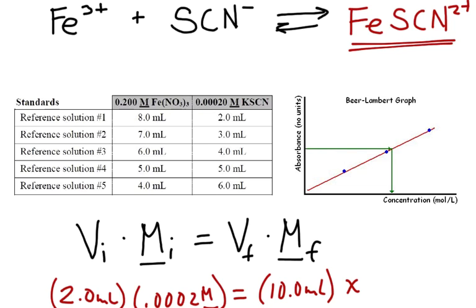Well, we start off here with the idea that one group of people were working on mixing together standard solution. To make a standard solution of this was a little bit tricky in that we had some iron nitrate solution, and even though it's iron nitrate, the nitrate for us is a spectator ion. We don't concern ourselves. So we say this is Fe3+ solution. We had another solution that was potassium thiocyanate, and again, we're not really concerned about the potassium, it's the thiocyanate solution. And when those mix together, it turns to this reddish-brown FeSCN solution.